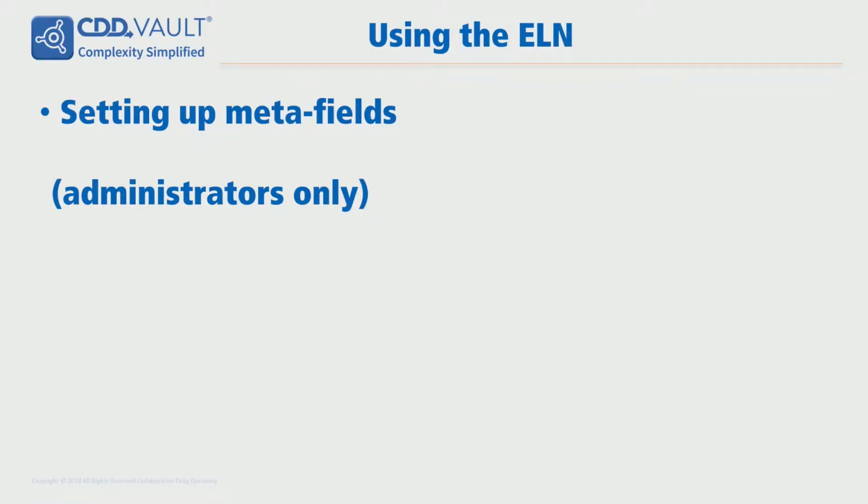Hi, and welcome to the CDD tutorial, mainly intended for an administrator. In particular, how to set up the meta fields for your ELN.